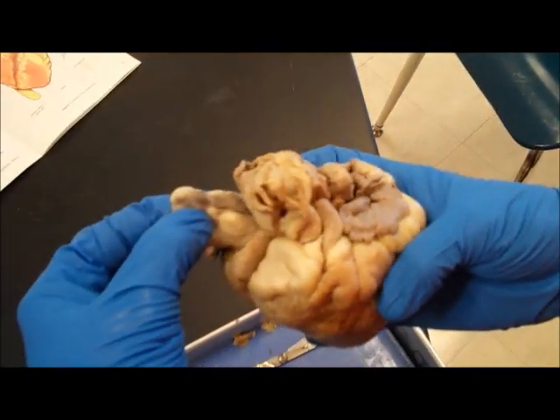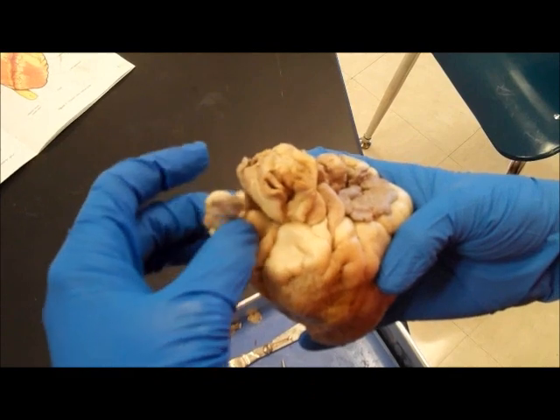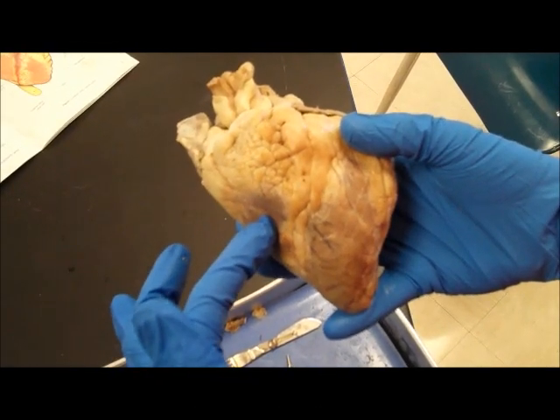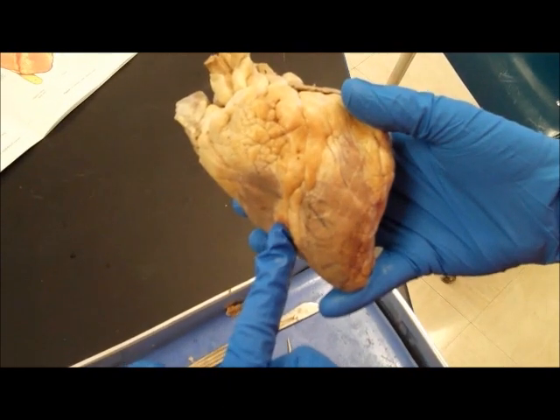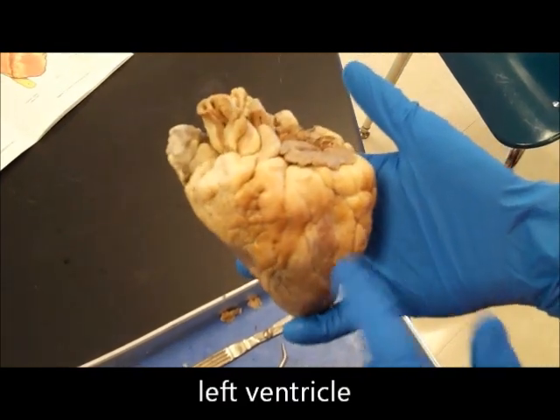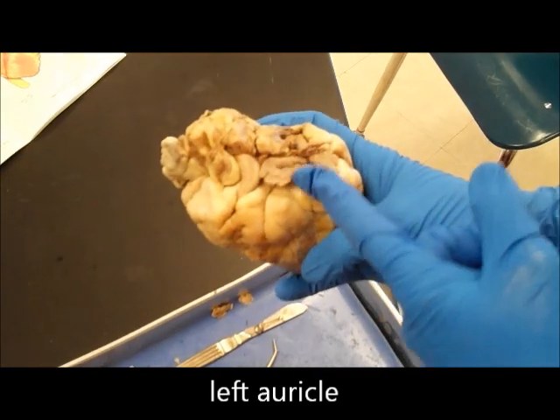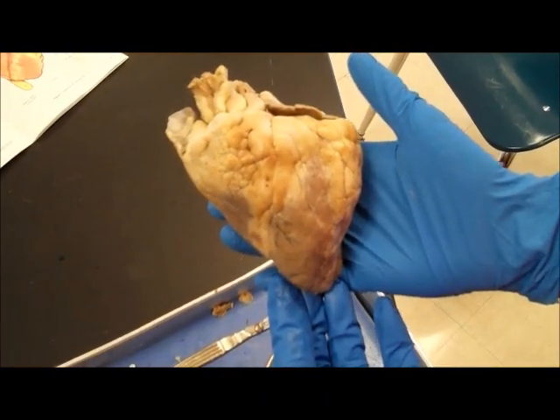I'm going to turn the heart up. You can see that this is the right auricle or atrium, and below that, right here, we have the right ventricle. Now the coronary artery is going to dissect the heart down the center. So on the opposite side of that, we have the left ventricle. And up here at the top, we have the left atrium and auricle, which is that flap-like structure. So again, this was the ventral view of the heart.